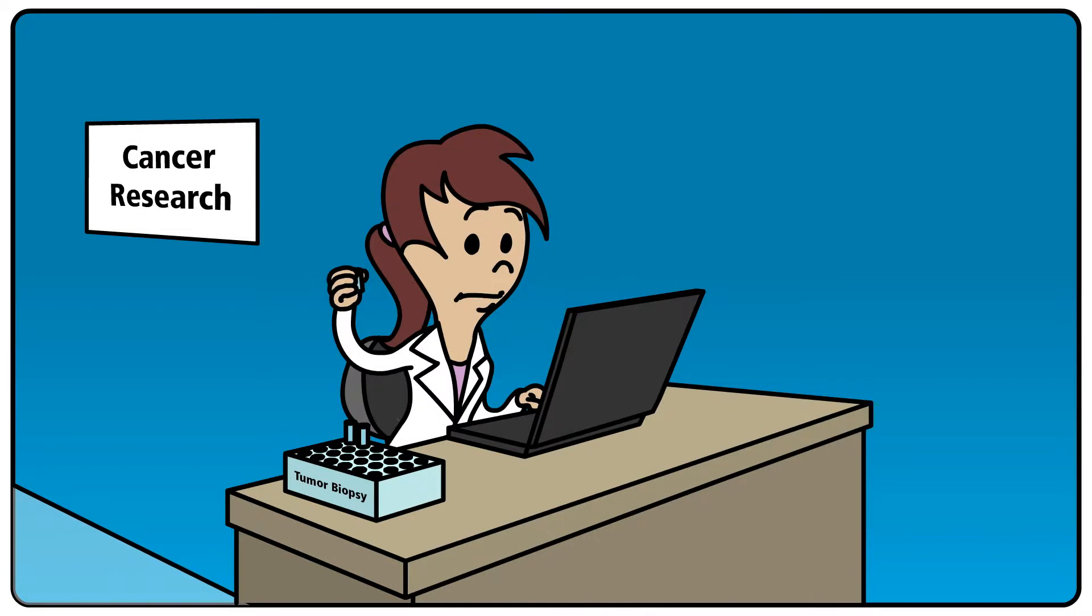Often, Sally has just one or two chances to collect all the proteomics data she can from a precious sample.